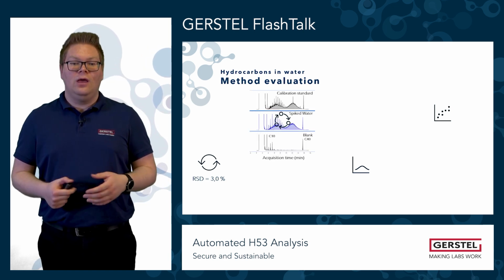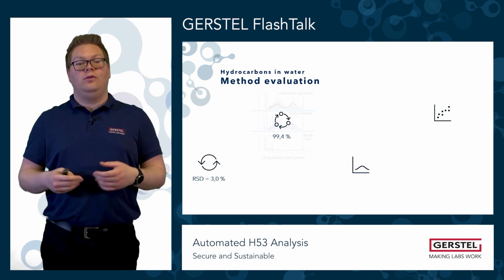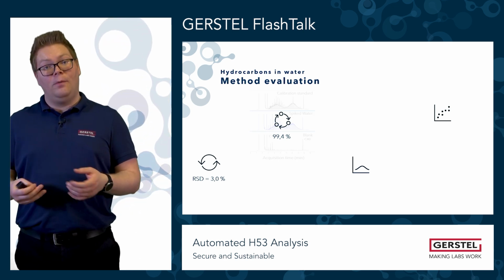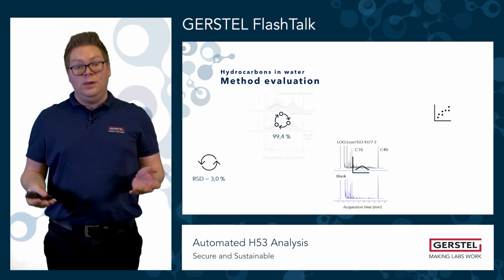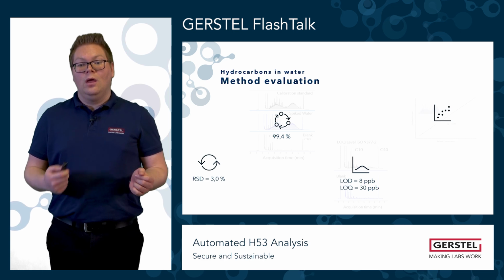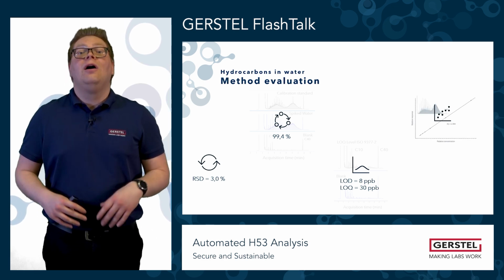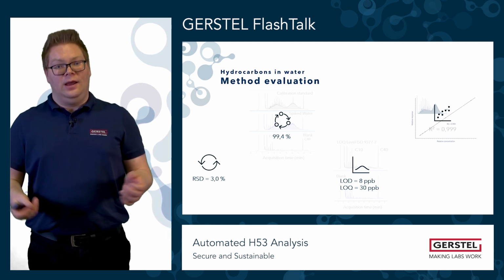For the recovery, they used spiked water and determined a recovery of 99.4%. The determined LOD is 8 ppb and the LOQ 30 ppb. For the linearity, they obtained a value of 0.999.